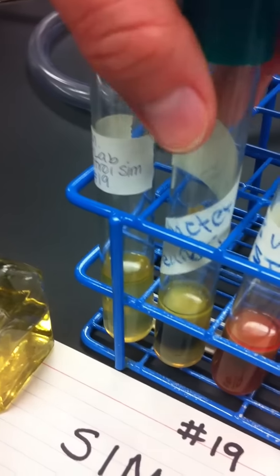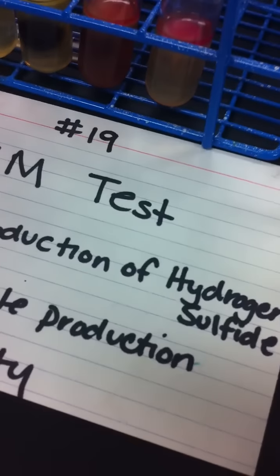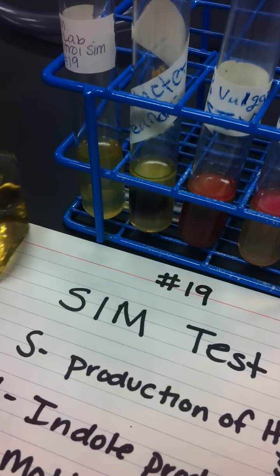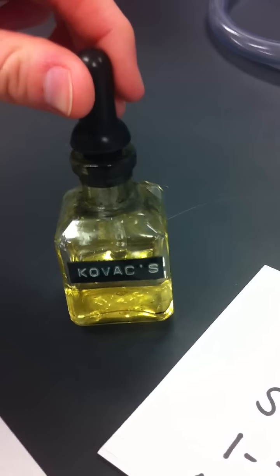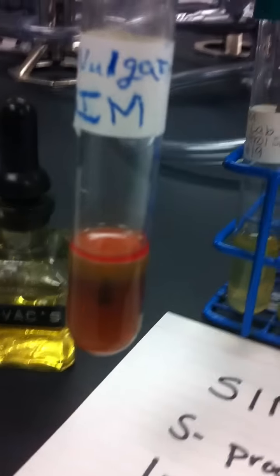Negative appearance would be no precipitate. The next test is production of indole. The enzyme is tryptophanase. The reagent is Kovac's. Positive appearance would be a red layer, indicating that indole is present.